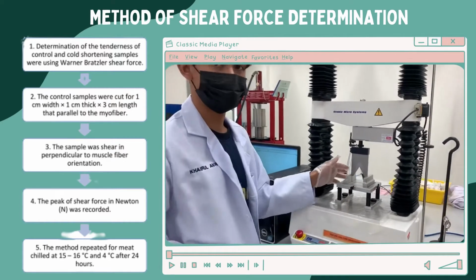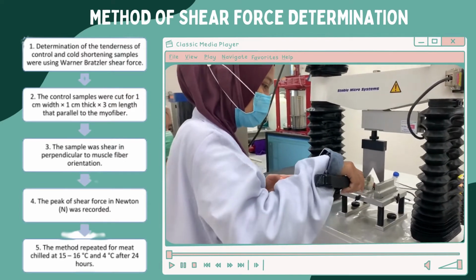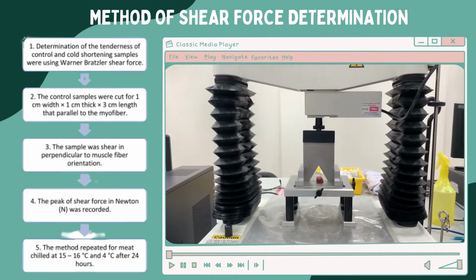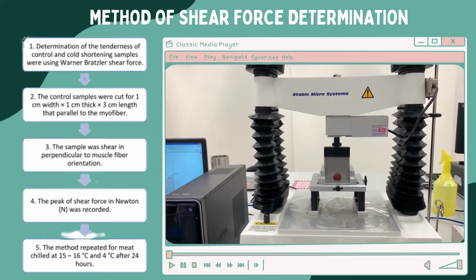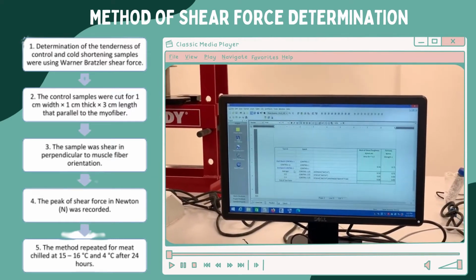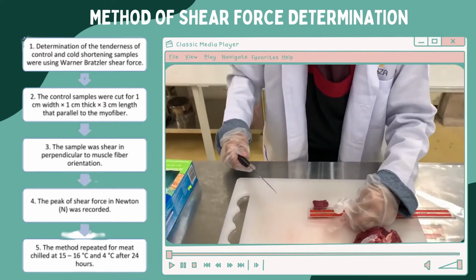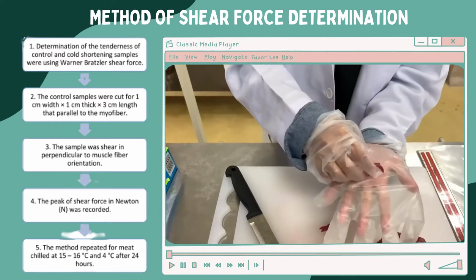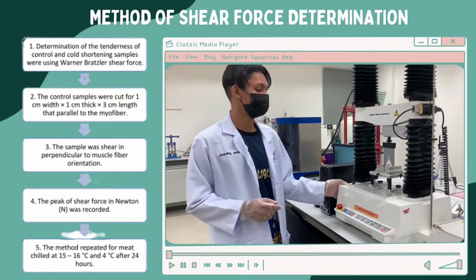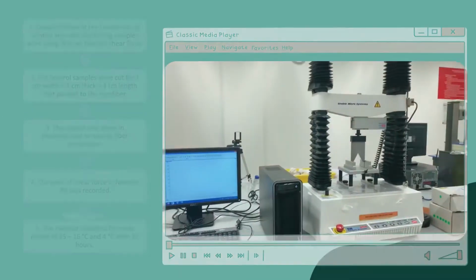Next is the method for shear force determination. Determination of the tenderness for both control and cold shortening samples used the Warner-Bratzler shear force. First, the samples were cut 1 cm width, 1 cm thick and 3 cm length, parallel to the myofiber. Then, the sample was sheared perpendicular to the muscle fiber orientation. The peak of shear force was recorded in Newton.